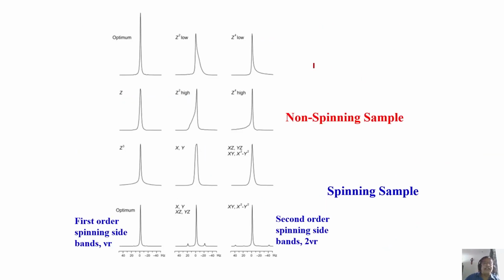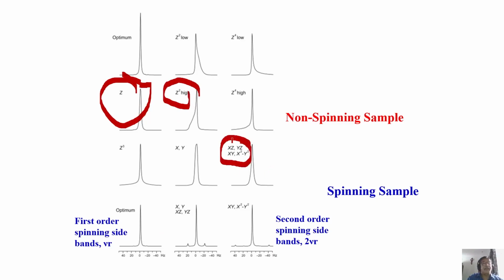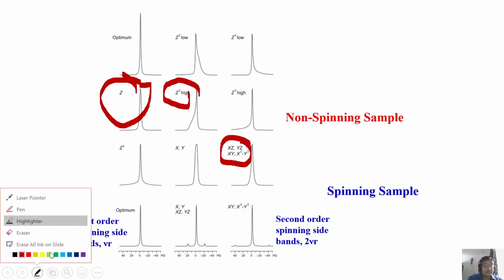In all the spectrometers, you have about 24, or sometimes 32 or 36, shim coils. There is a shim unit within the magnet. These are called room temperature shim coils, and there are about 36 of them. Some of them will vary the magnetic field gradient along the z-axis. By varying the current, you can create a counteracting field along the z-axis, sometimes along z-square, or x and y combinations, varieties of things you can see. And each of them, here you can see what is going to happen.